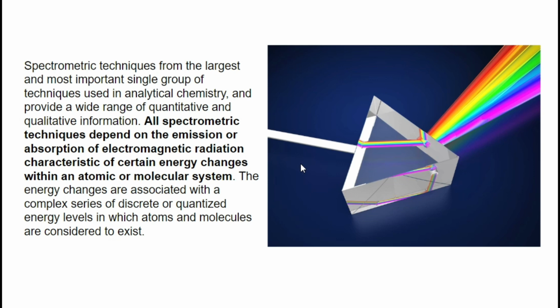Lagi nga po yan na bago po natin ma-measure yung ating mga analytes, especially here in clinical chemistry, we should know at least what wavelength do we measure them. Kasi po tayo, sila medtech po madalas kapag manual po yung machine or semi-automated yung machine, tayo po yung taga-input muna ng wavelength. Depende pa po yan doon sa instruction coming from the manufacturers of the reagents that we will be using.